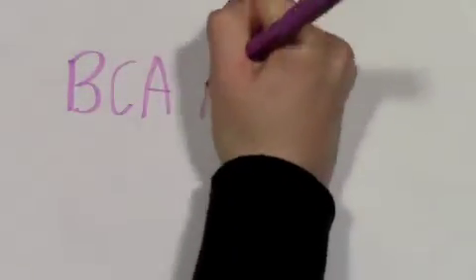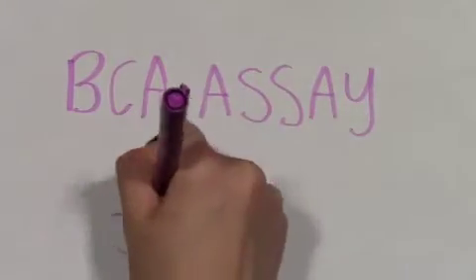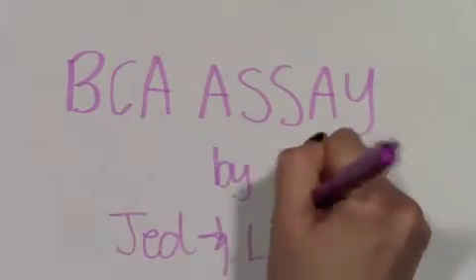How to do a BCA assay by Lindsay and Jed. A BCA assay allows you to determine the concentration of protein in a sample.